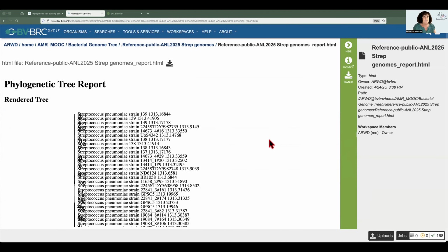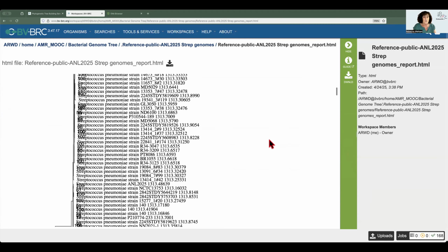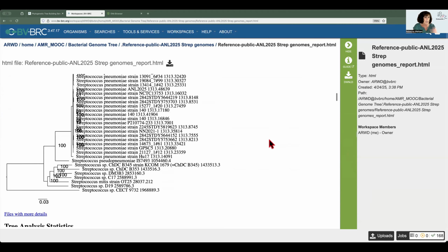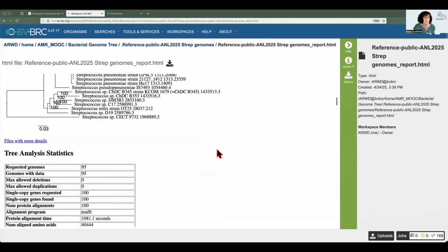And it shows us a tree, a static view of a tree here with all of the genomes. You can't see any of the groups. You can't cover it right now. But look, it's got a really nice way of showing you the sort of outgroup genomes. Spoiler alert, these are the reference genomes. And so it makes the tree, I think, look nice.